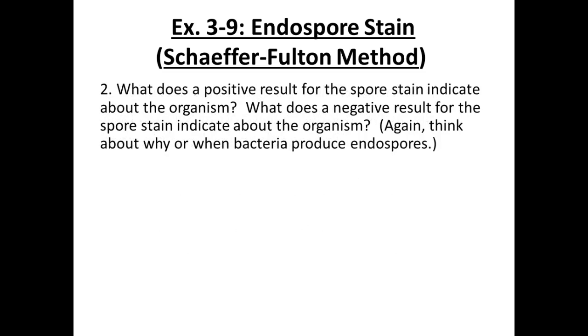What does a positive result for the spore stain indicate about the organism? That it has the ability to form endospores under harsh conditions, right? And in this case, we did employ harsh conditions, so we did see endospores. She asked, are we going to have some that don't have endospores? No. Or at least I hope not.